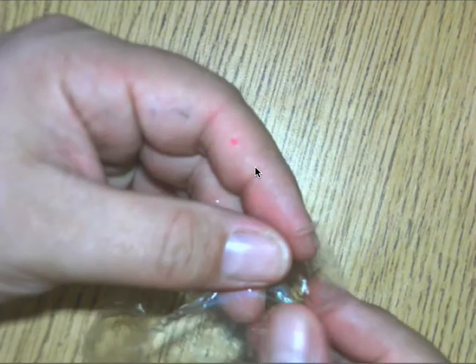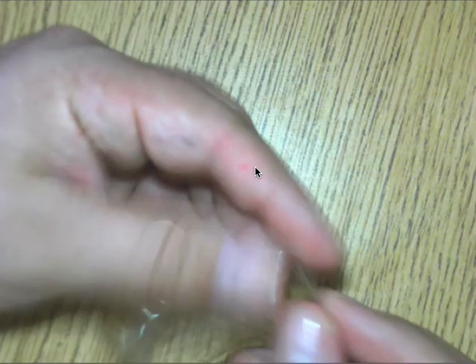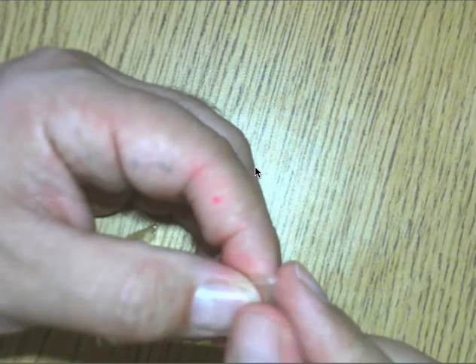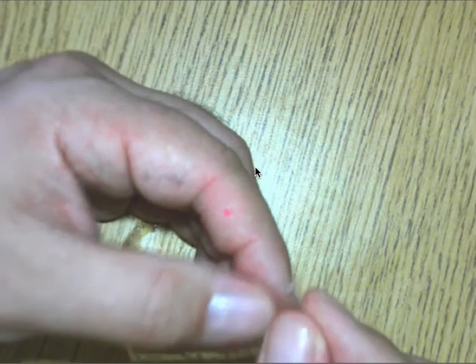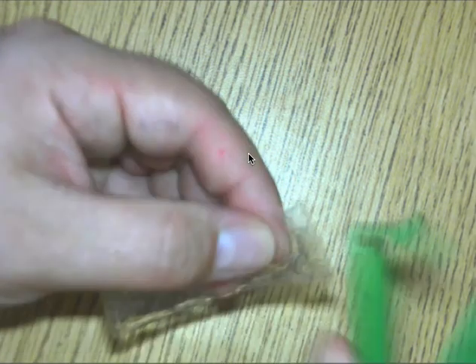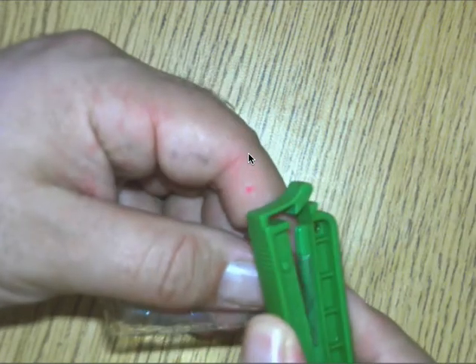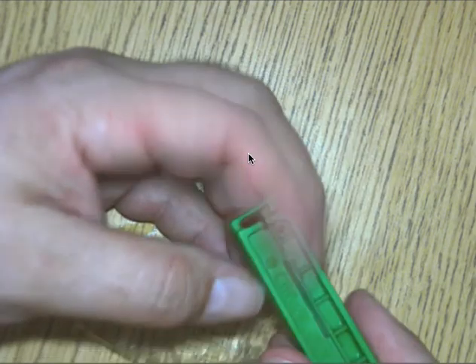Now it says take a clip, so we're going to take it. I take the other end because this is open. We're going to flip about a centimeter or so of it. I'm going to take our clip here and clamp it down so you have a nice good seal.